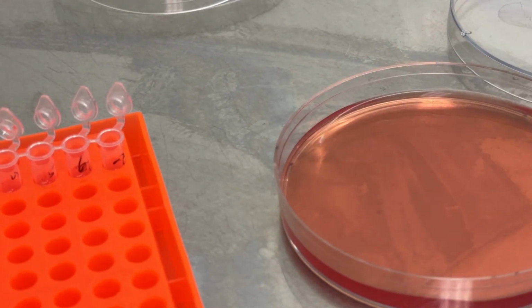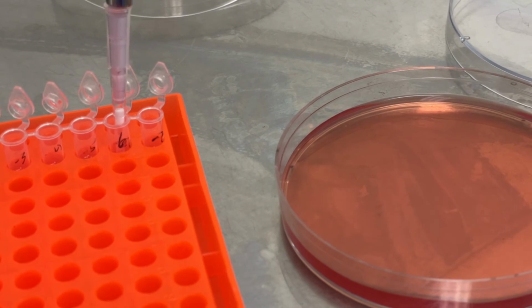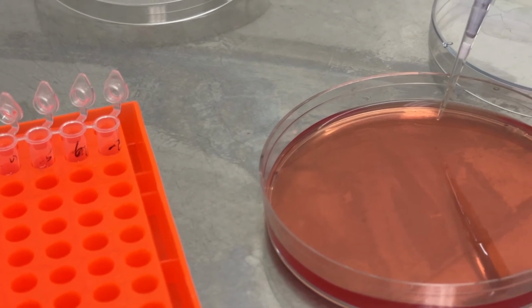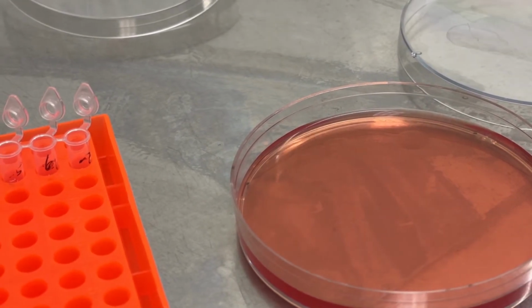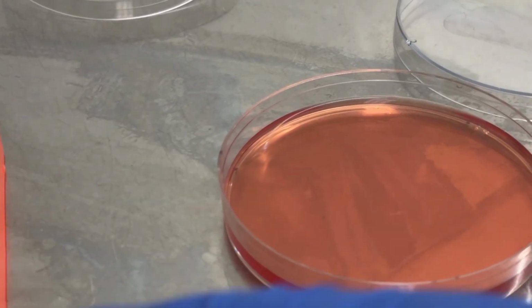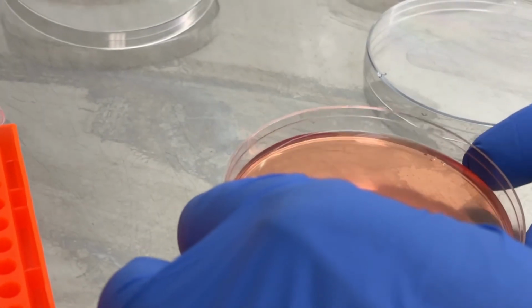This can be done repeatedly with multiple small deliveries, spaced so that they do not run into each other. And this can be done multiple times around a plate, as you'll see in one case. It's again good not to puncture the surface with the pipette. These are allowed to just dry, and you can see they will sit there and not mix, but they will eventually soak in and dry, at which point the plates can be inverted and stored at 37.